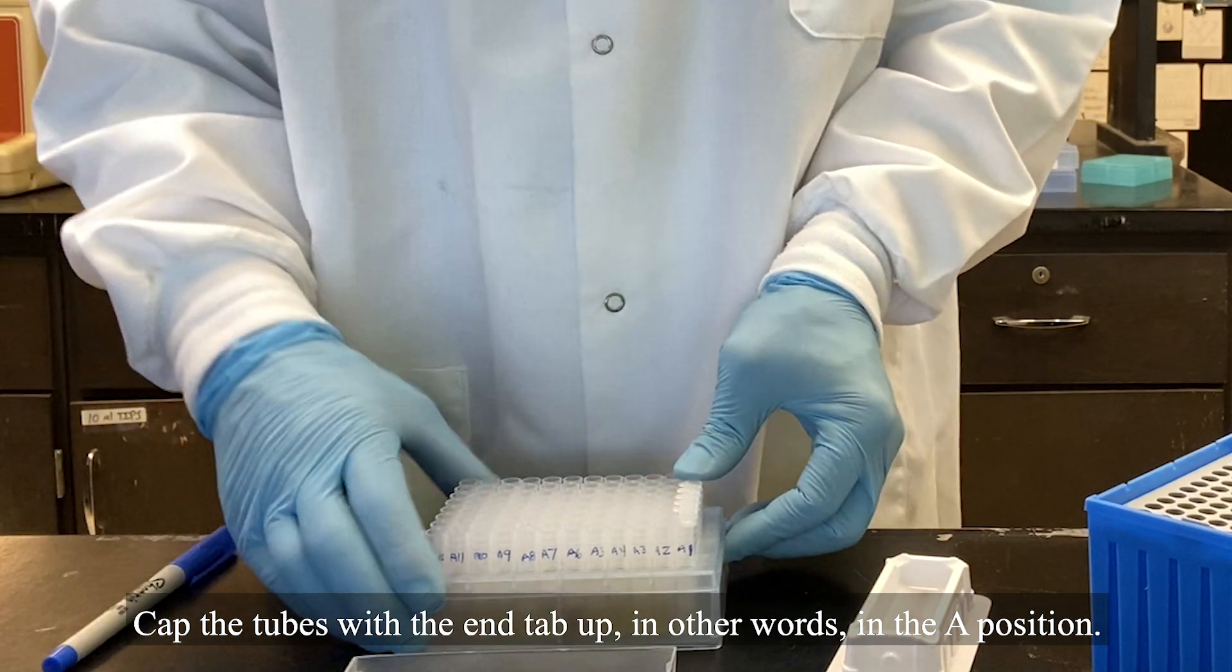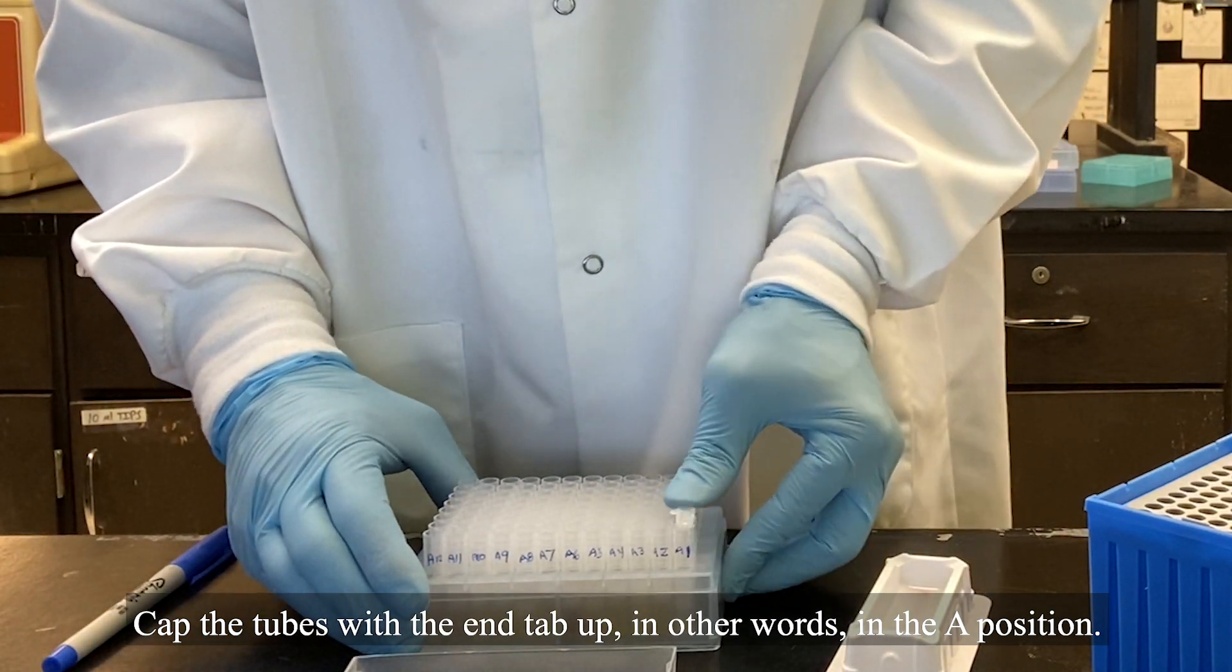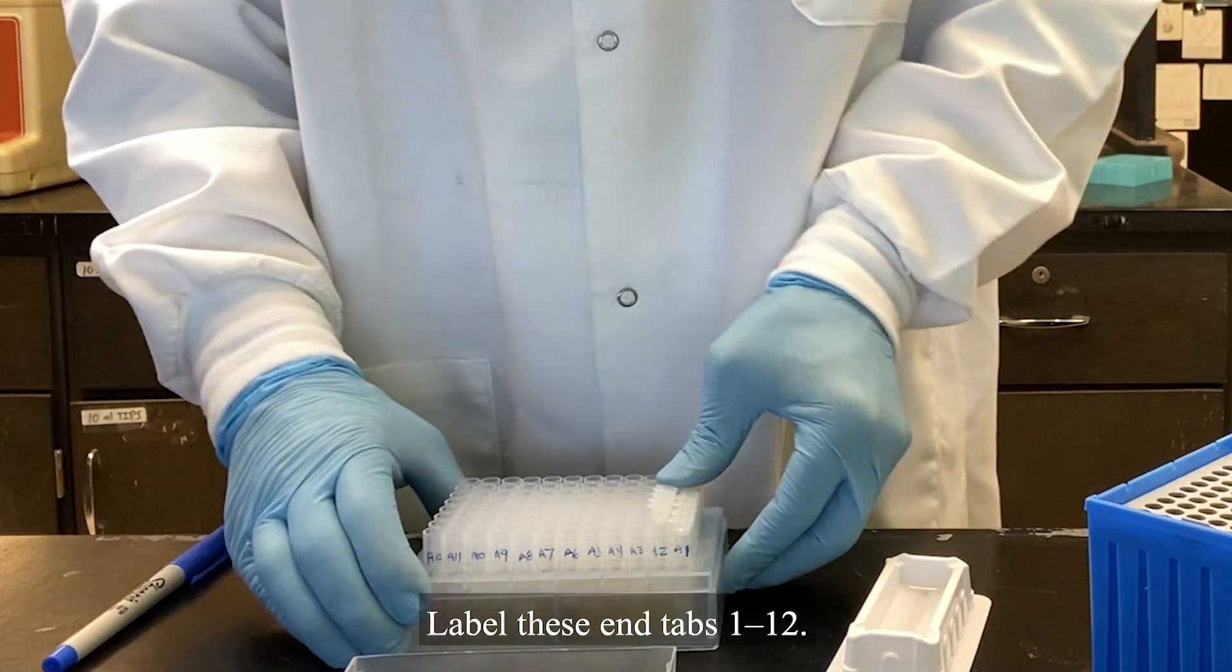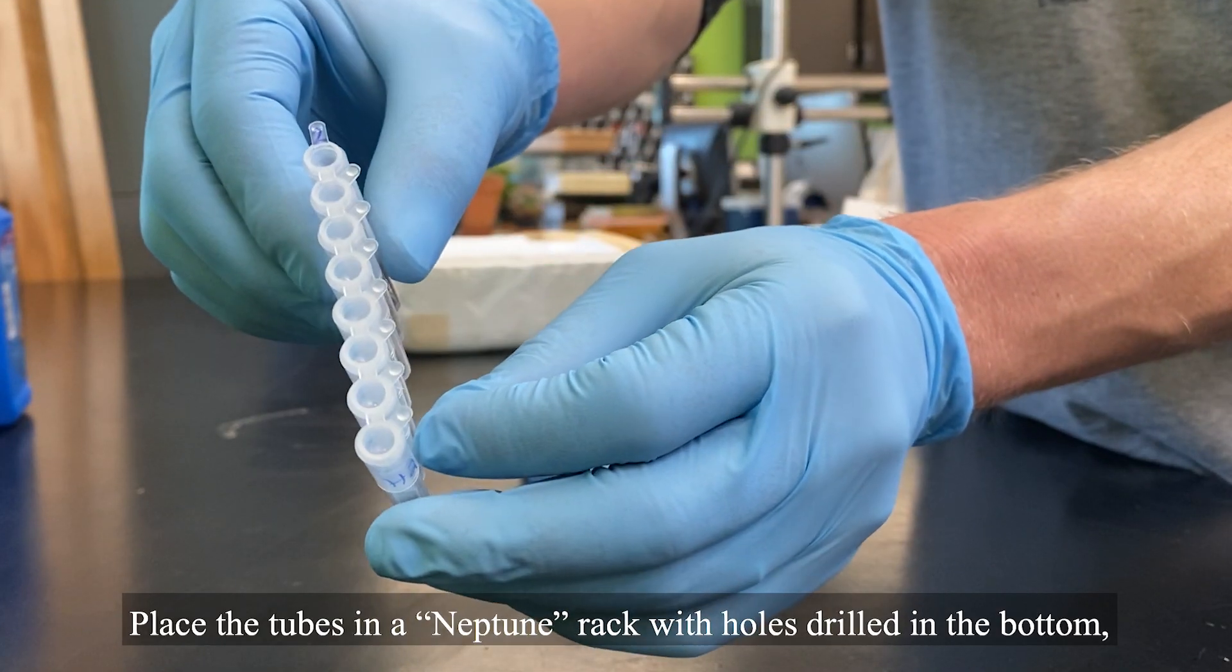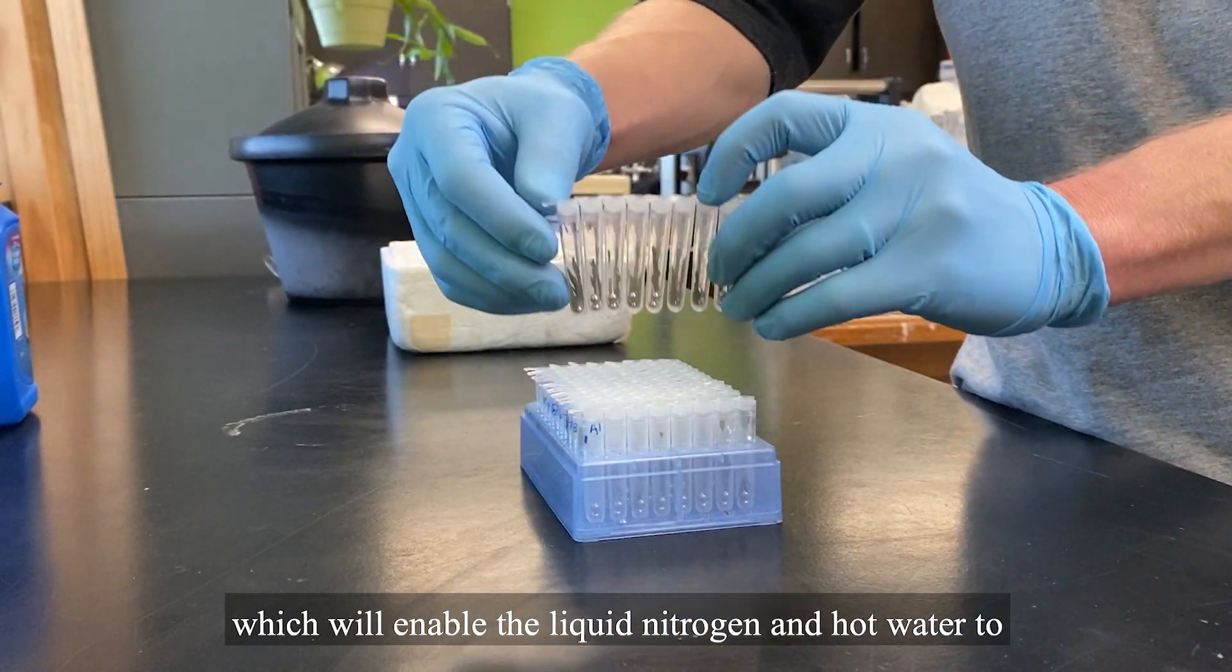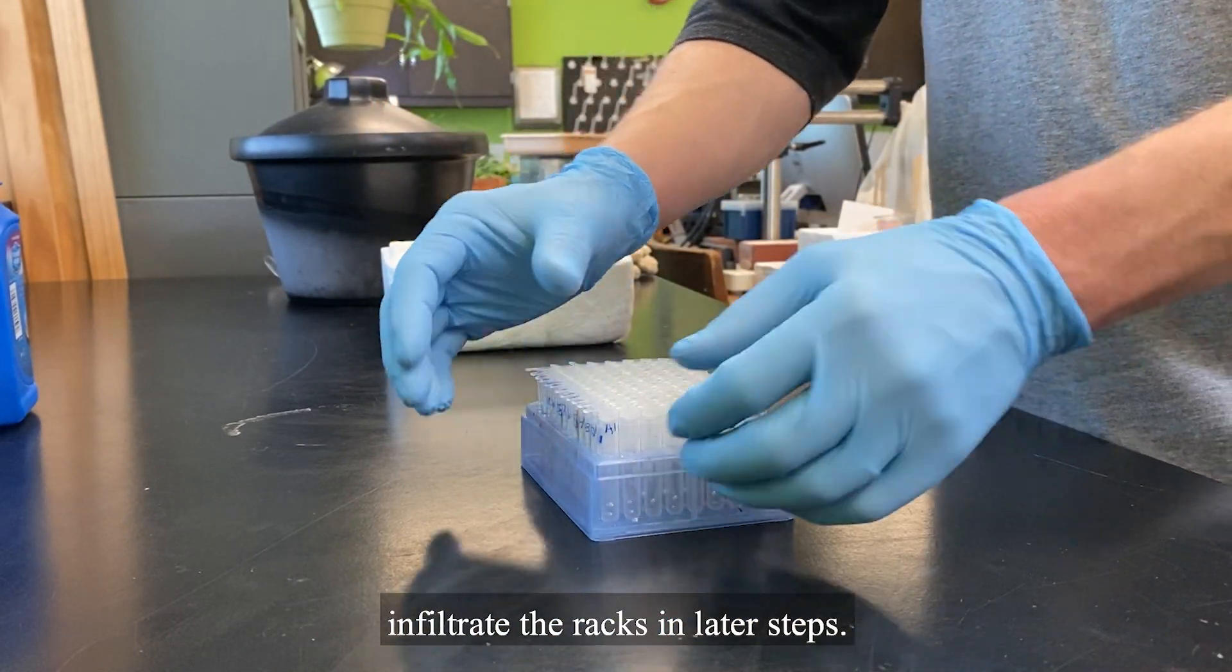Cap the tubes with the end tab up, in other words, in the A position. Label these end tabs 1 to 12. Place the tubes in a Neptune rack with holes drilled in the bottom, which will enable the liquid nitrogen and hot water to infiltrate the racks in later steps.